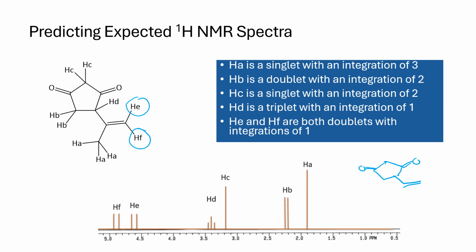They're different because if you replace either one with deuterium, you're going to get the E or the Z. Remember, that's a methyl, so these two are the same. Notice they are homotopic. You don't have a chiral center. And here, these two again, different. Okay.